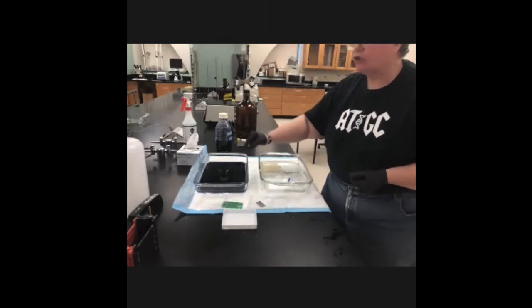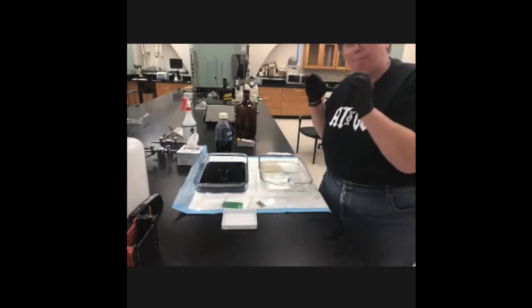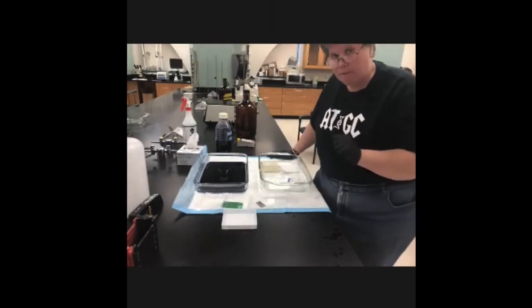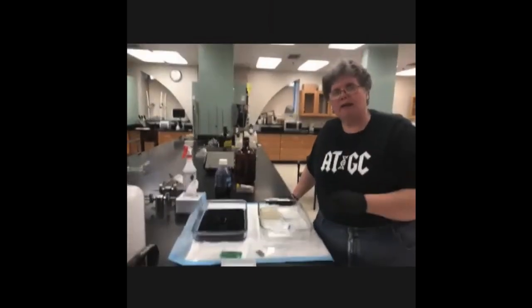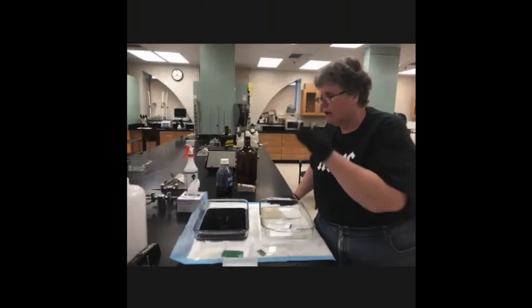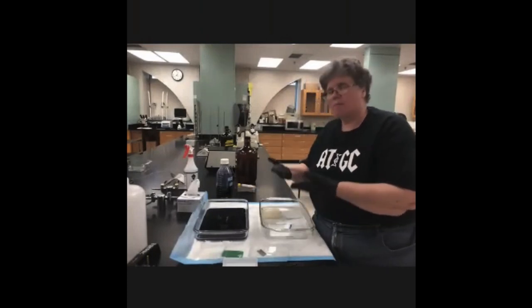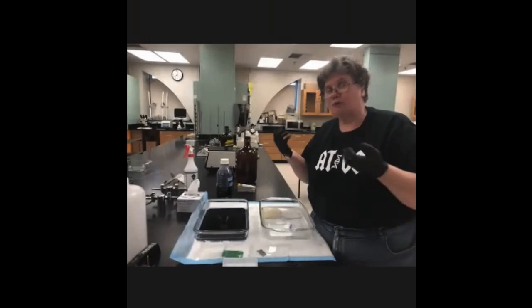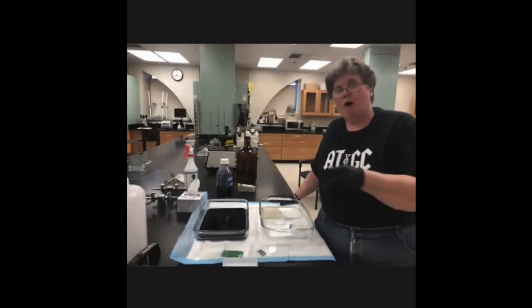And then that will slowly take the Coomassie Blue out of the gel, except for where the proteins are. Wherever the proteins are, the stain will remain attached to the proteins. And this is not an instantaneous process. It comes out slowly and it diffuses into the solution. So you need multiple buffer changes over time.